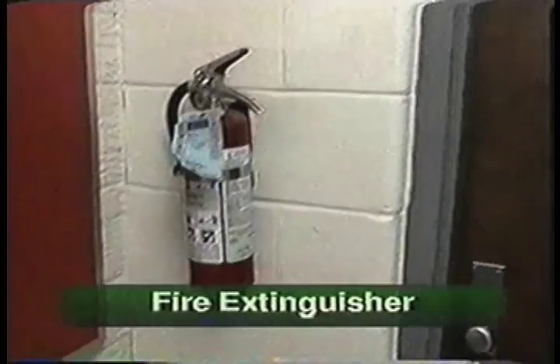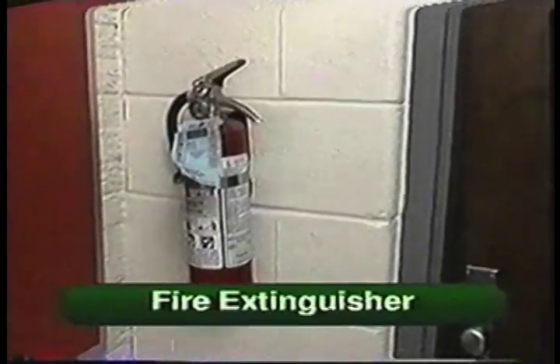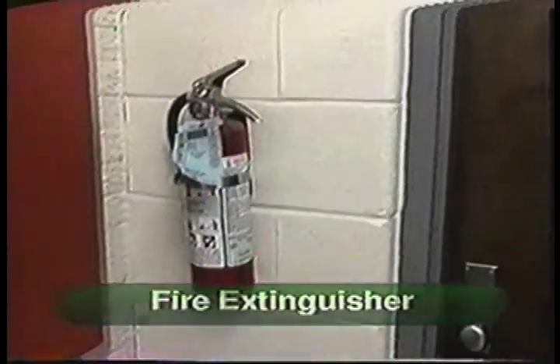For starters, each lab should have a first aid kit. Take a moment to locate it now and remember where it is. Make sure you know where to find the fire extinguisher. It's probably hanging on the wall in an obvious place. When unexpected flames erupt, remove it from the wall, pull the pin, aim at the base of the fire, and squeeze the handle until the flames are extinguished. Know the proper fire drill procedures and know the locations of fire exits.